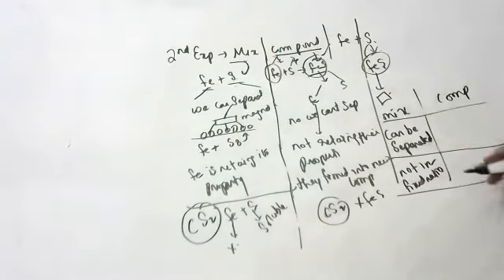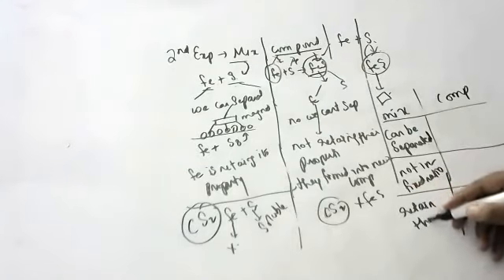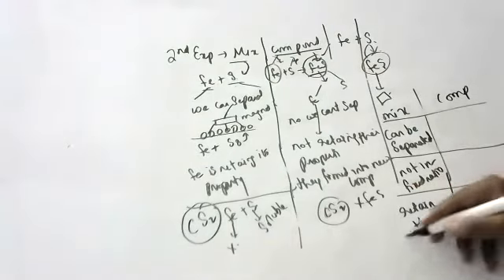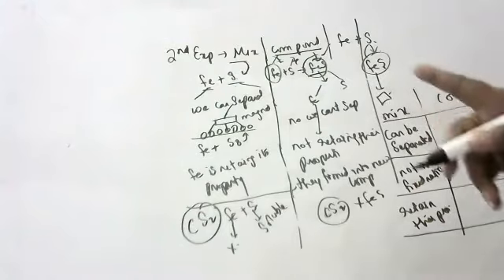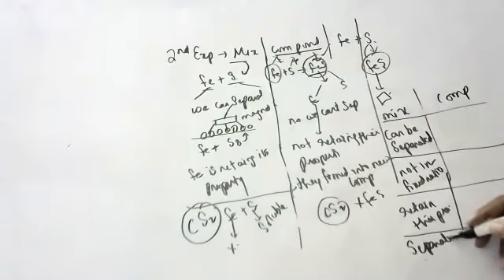And the constituents retain their properties. No new properties are formed. Separation can be done physically. You can separate them physically, by hand also.